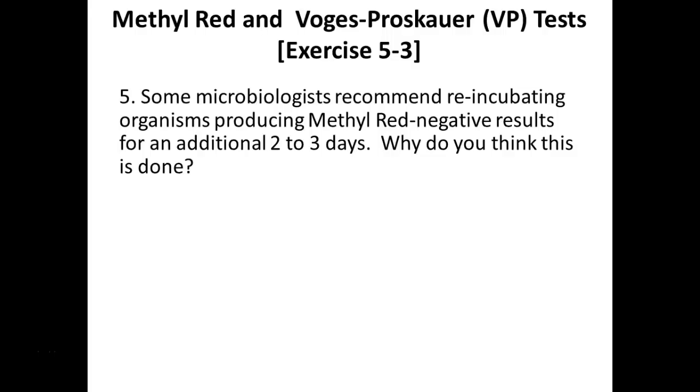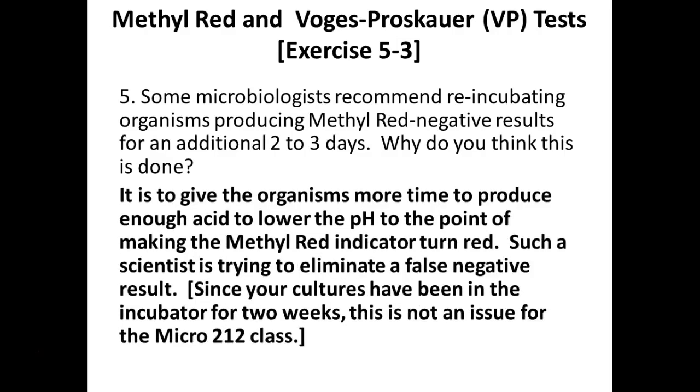So some microbiologists recommend re-incubating organisms producing methyl red negative results for an additional 2 to 3 days. Why do you think this was done? More time, you're going to produce more what? Acid, right? So more likely to get a positive result instead of a false negative. Again, ours were inoculated a long time ago. The only problem is we still had some false negatives, so I don't know what was going on there. We'll investigate that.